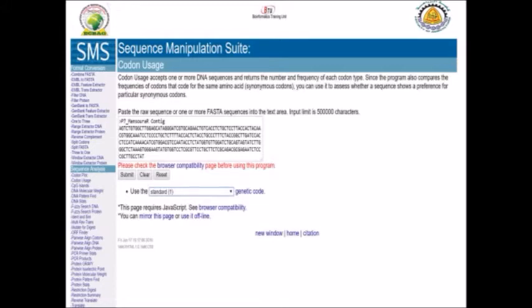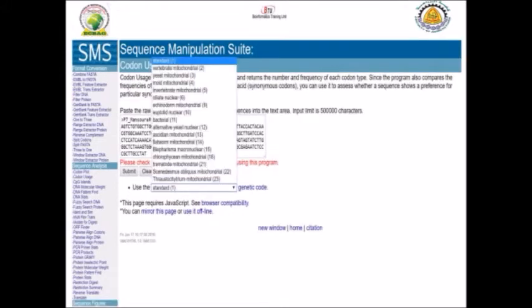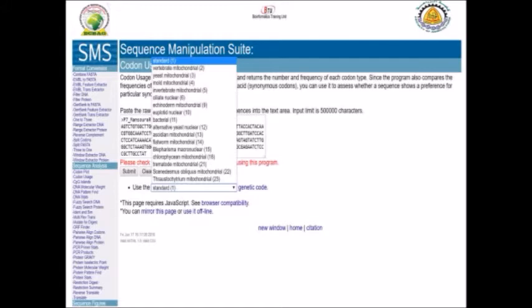It gives you the option to use any coding table, like vertebrate mitochondrial, yeast mitochondrial, bacteria, or other organisms. Different tables can be chosen, but if you use only the standard one, you can just copy and paste your sequence in the submission box and press submit.